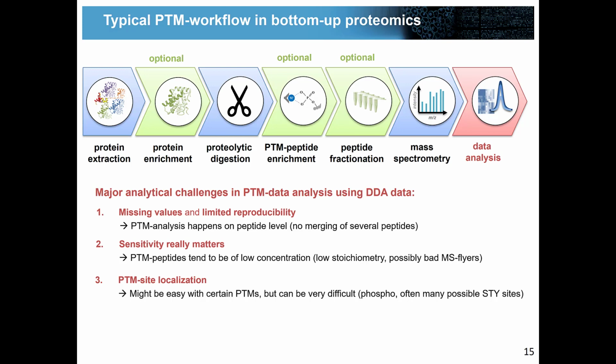Because if you do a DDA analysis, and the algorithm that you're working with is not capable of reproducibly putting a certain PTM always on the same amino acid in a peptide, but instead, in sample 1, the algorithm says a certain PTM sits on serine number 3, and then in sample number 2, it puts the same PTM on serine number 4, so another serine, what will happen is that the data matrix that you will generate in the end will contain more phosphopeptides on the y-axis, right?